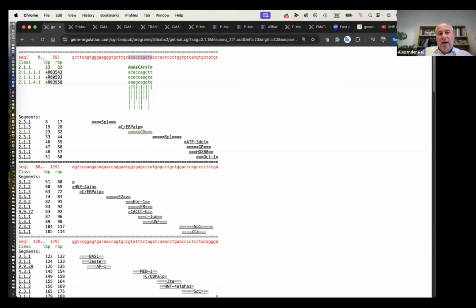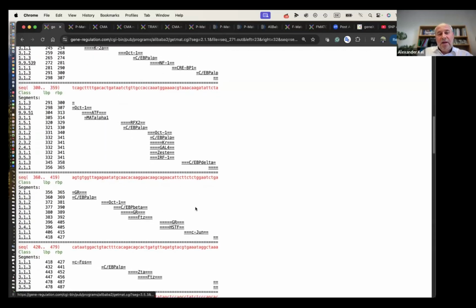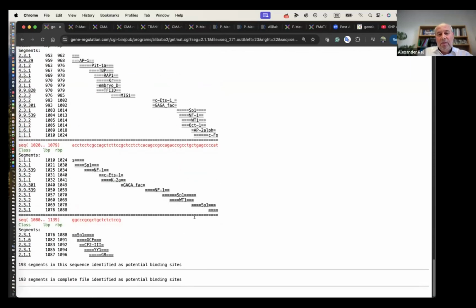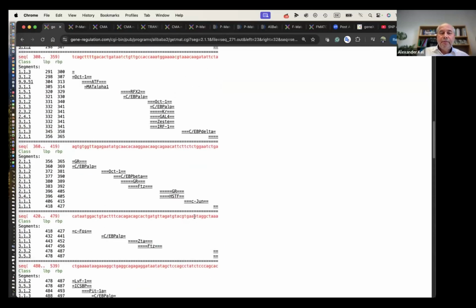And as soon as it has aligned enough sequences from TRANSFAC which belong to the same factor family, it tries to build a positional weight matrix from those sequences on the fly, and then estimates the score of that predicted binding site. And you see, although it finds many sites, the overlap is much smaller if you compare it simply to the match.